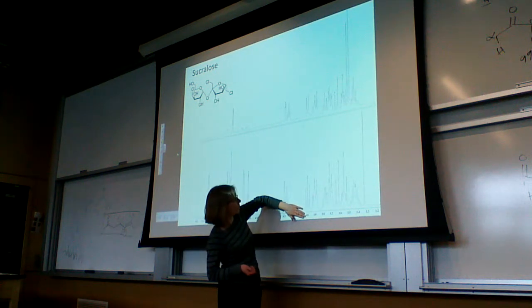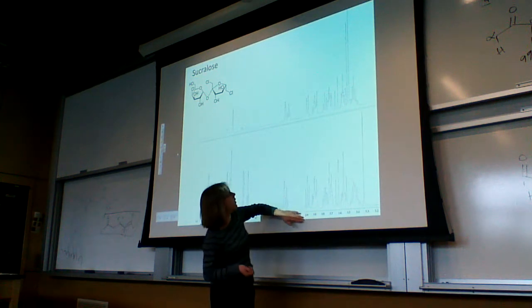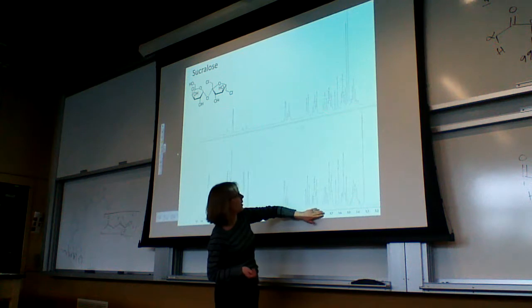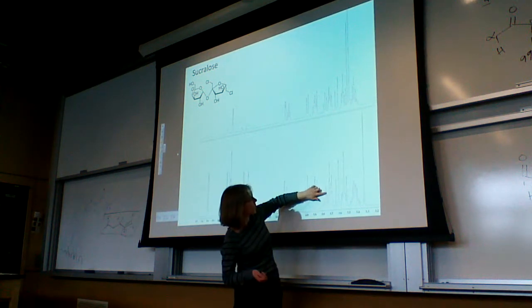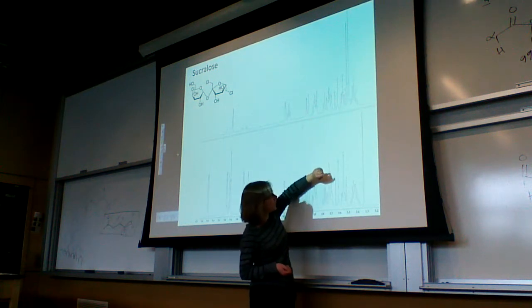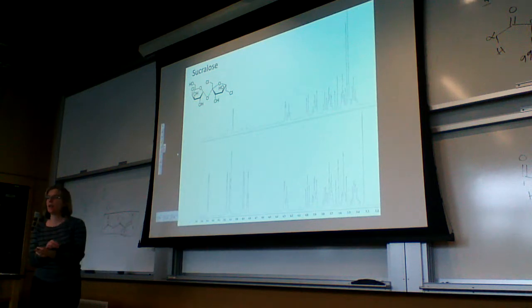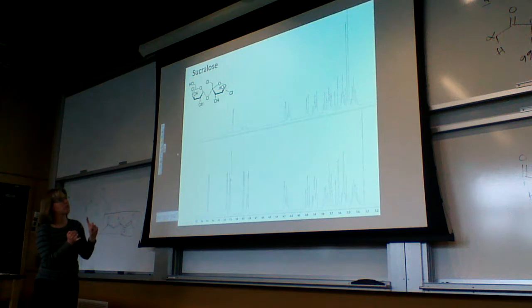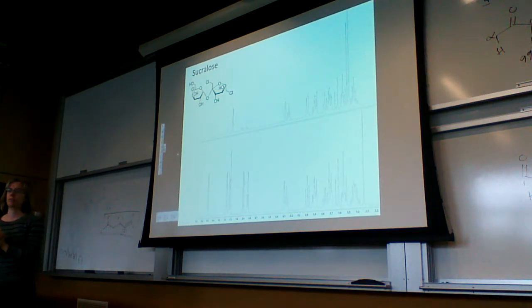So our peak at 4 goes from a triplet to now a doublet. And let's see, the peak at 3.75 or so goes from a more complicated quartet to a triplet. So we're taking away this extra splitting that was there, and it helped to simplify the structure so that we could assign all those peaks. So the deuterium exchange, if you have splitting, can help simplify your splitting patterns as well if you're seeing your OH splitting the CH2 next to it, or the CH in this case.